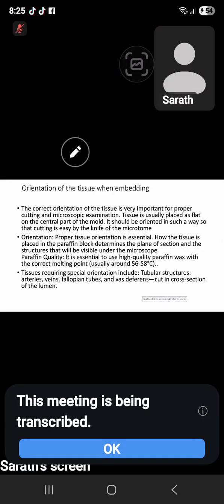The correct orientation of tissue is very important for proper cutting and microscopic examination. When you are doing the embedding, the person must have thorough knowledge about the orientation of tissue. Otherwise, when cutting, the cutting person has a lot of problems and you can't get the target. Tissue is usually placed flat on the central part of the mold. How are you going to keep this tissue? At the center, you have to keep it flat.